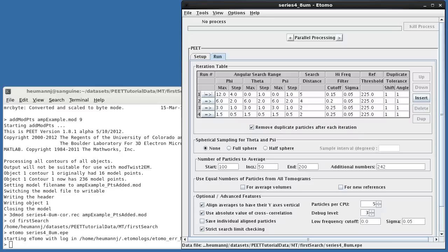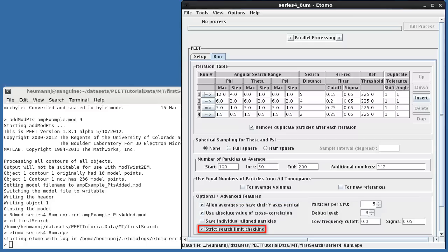I've requested that the final averages be rotated to have their y-axis vertical rather than along the direction of the reference's y-axis. Finally, I've also selected strict search limit checking. With this option, no particle will be allowed to rotate more than plus or minus 12 degrees in phi from its original position, since that's the largest max specified for phi. If this option is not checked, particles could rotate up to the sum of the max values at the current and all previous iterations. Similar considerations apply to the other angles and to translational shifts.